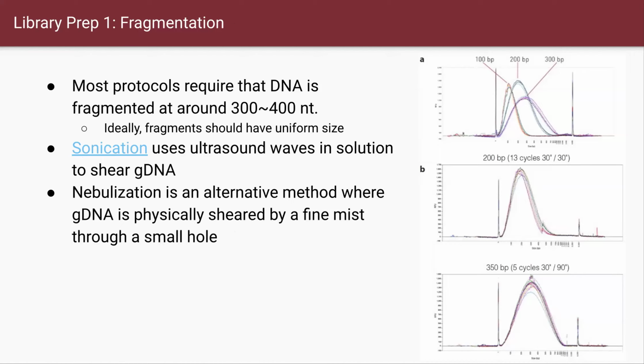Since the DNA sequence is a really long linear sequence, you have to chop up that DNA sequence into pieces. So how can we do that? We use a physical force, which is ultrasound waves. You put the DNA into water, since DNA is a soluble material. Then within this water, you apply the ultrasound wave, which physically breaks down the DNA structure into small pieces, right?